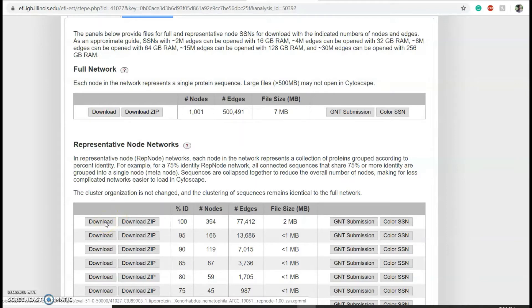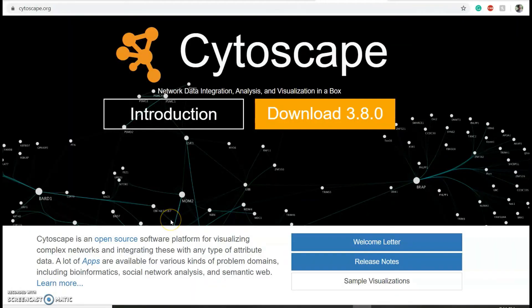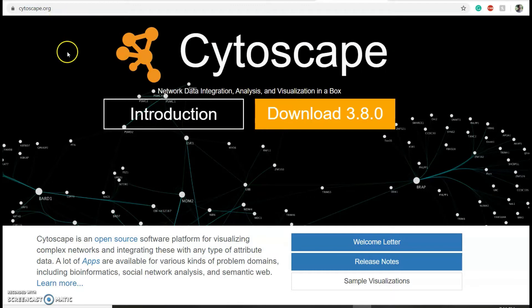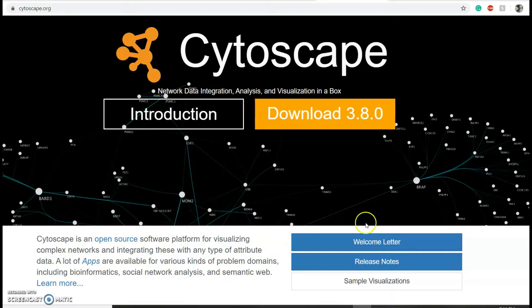This file has my sequence similarity network which I can visualize using Cytoscape. To download and install Cytoscape, just go to cytoscape.org, download the program, and follow the instructions. Once you've downloaded and installed Cytoscape, open the program.